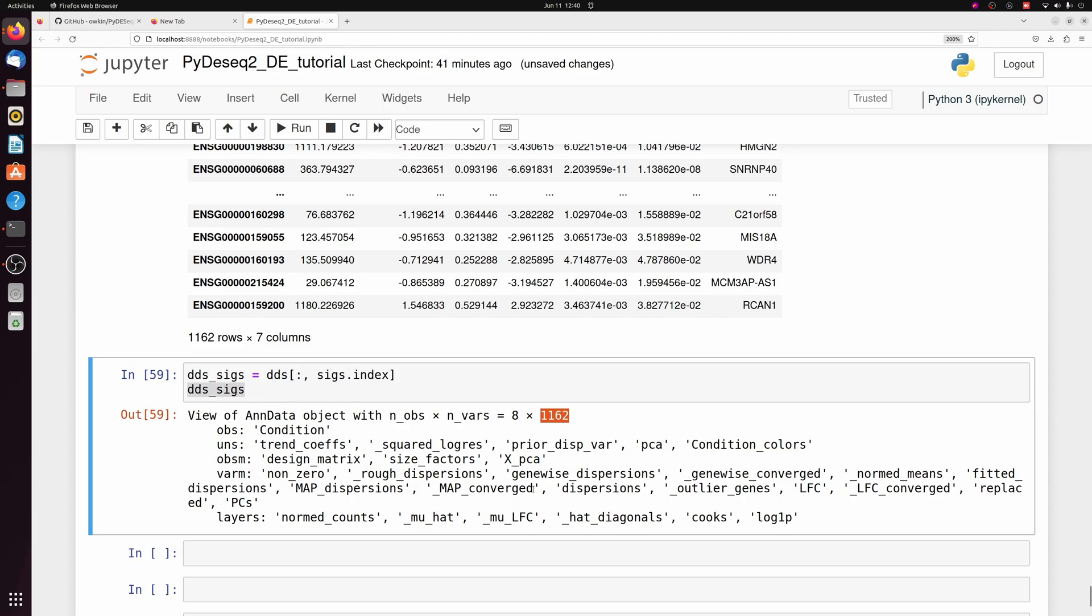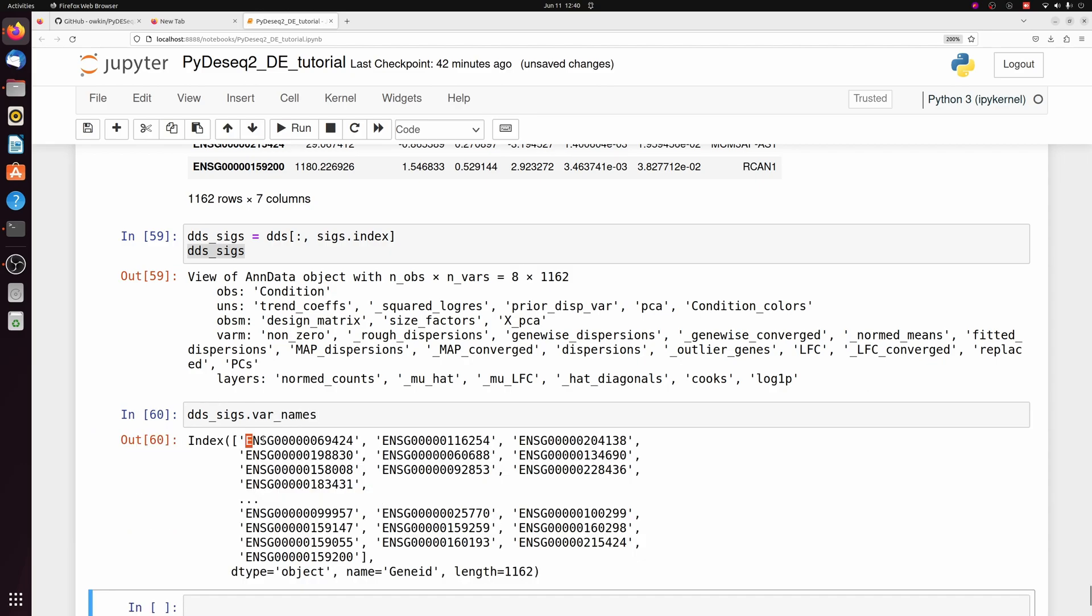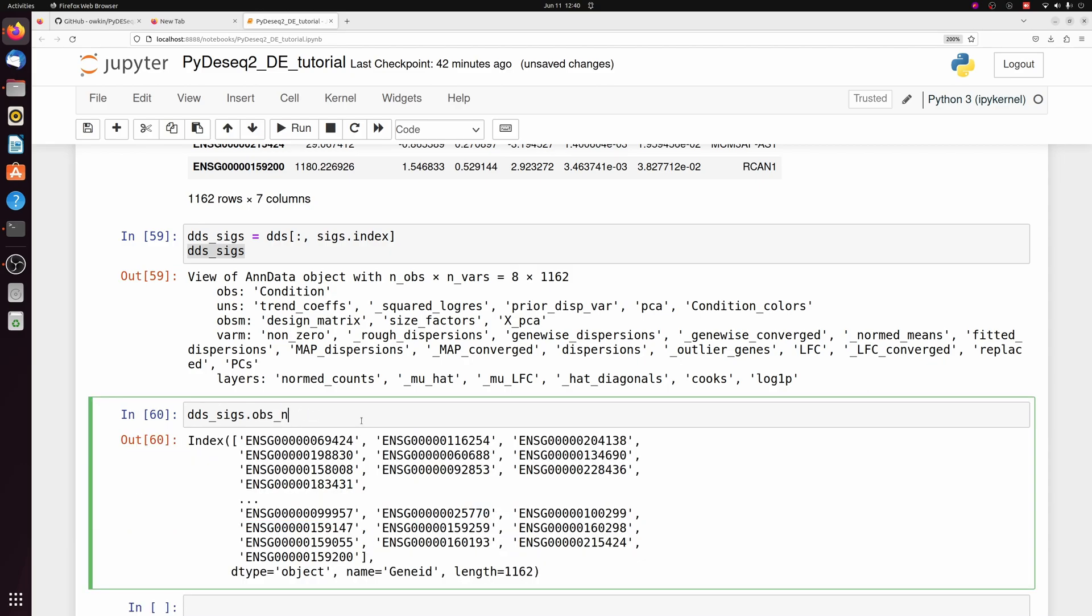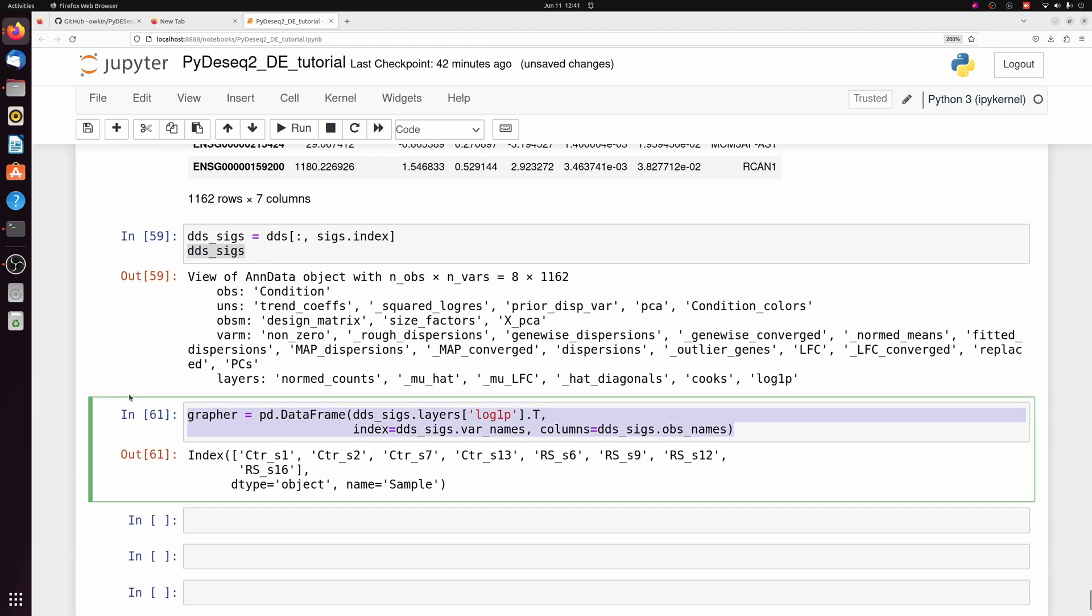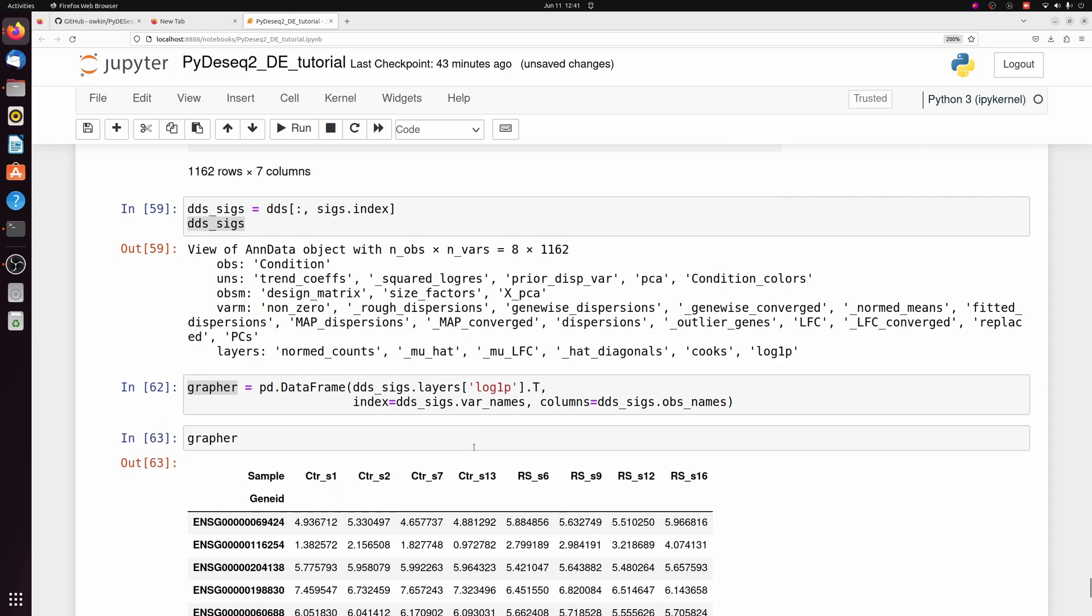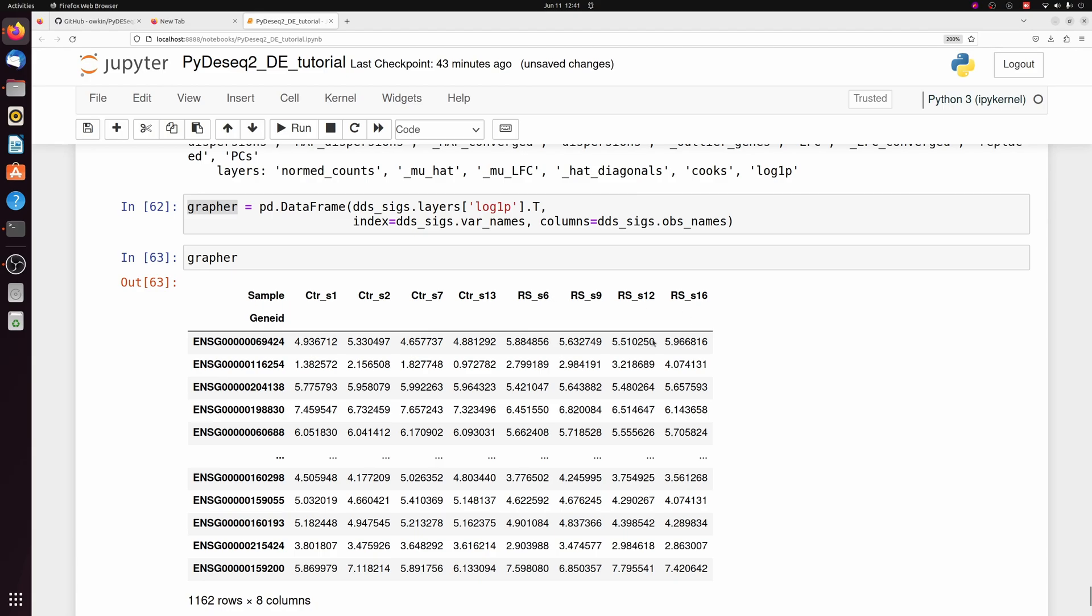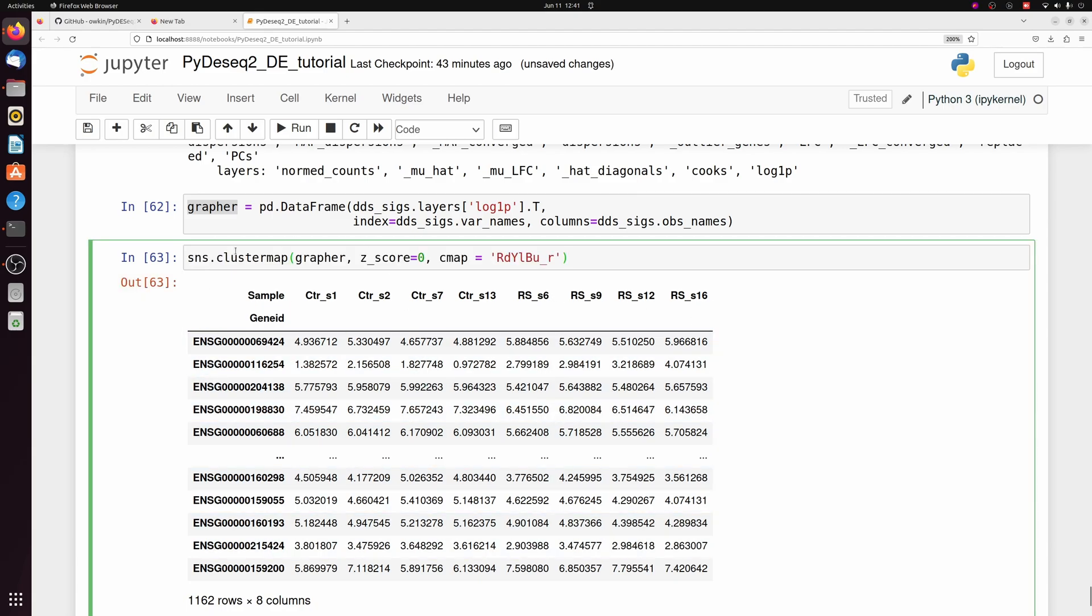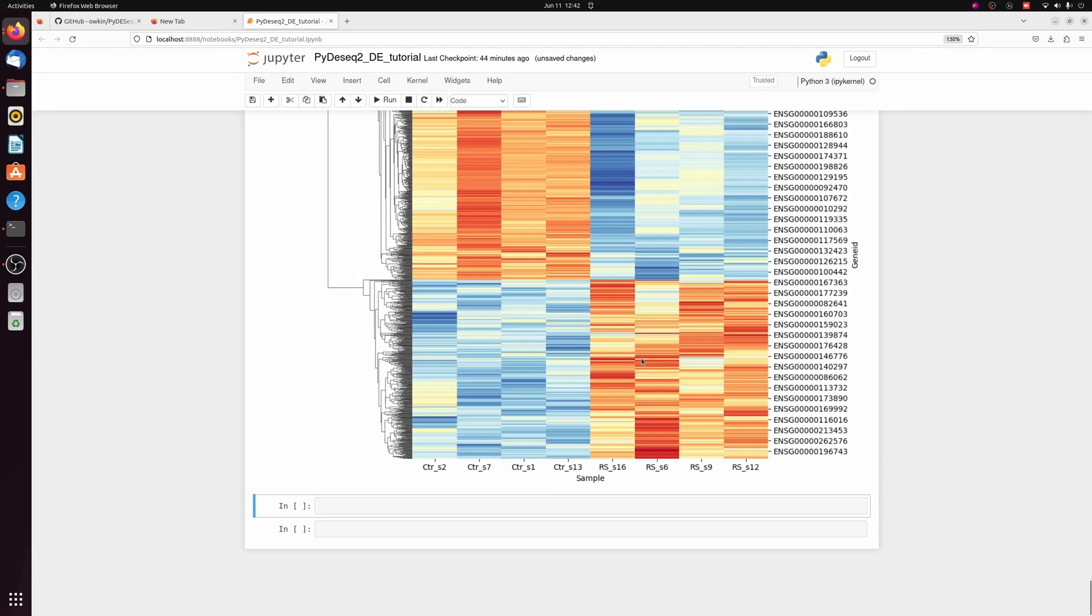We need three things to make a heat map here. We need the log1p values. We need the var names from our DDS sigs, which is just the gene IDs. And we need the obs names, which is the sample names. So we can throw those together into a pandas data frame function here. So we're passing the log1p. Importantly, we have to transpose it here because I want each row to be a gene to set the index to those var names. And we want the columns to represent the sample names. So if we look at that, it's just a data frame with the sample names, the genes, and the values. So we can plot that with seaborn cluster map, passing that data frame. I'm going to calculate the Z score, and I'm just picking a different color map from the default one. And here we have our heat map.